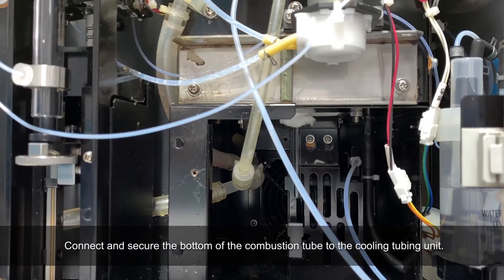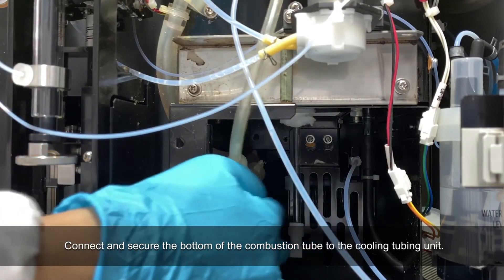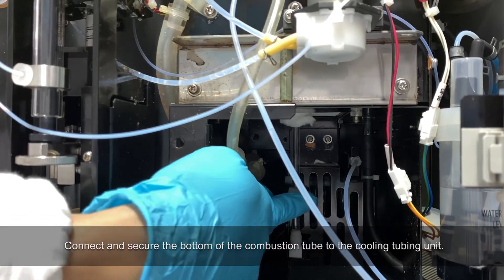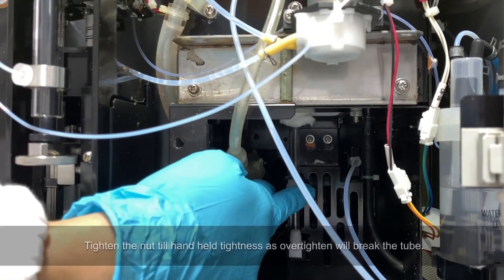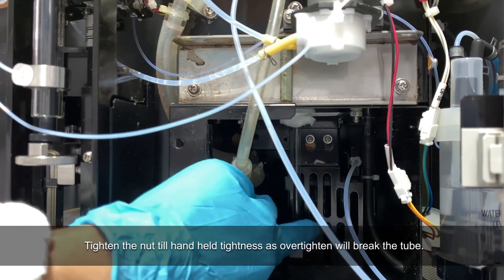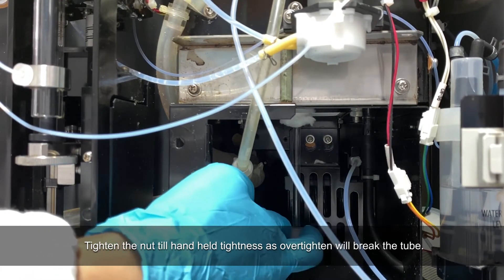Connect and secure the bottom of the combustion tube to the cooling tubing unit. Tighten the nut to hand-tight tightness, as over-tightening will break the tube.